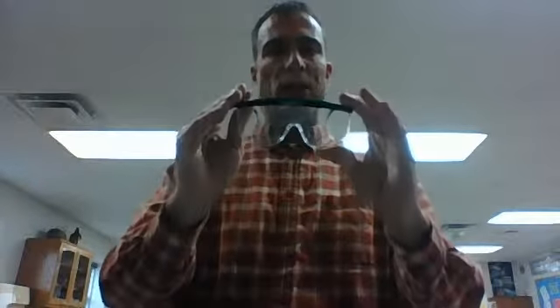Next, I have goggles. Goggles we're using when we're using alcohol burners, dangerous chemicals, glass, things that could break and get into our eyes. These are goggles. We also have the goggles that actually have the rubber strap that go right to your face, suck to your face. So it's a little bit more enclosed. These are more like safety glasses, but we'll call these goggles for our case.